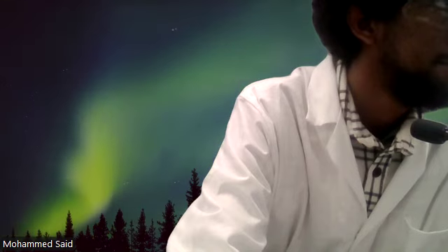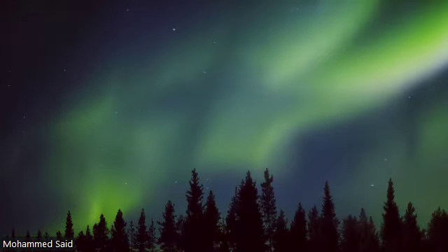If you've done, so my previous practical has done capsule staining for the unknowns as well. It's good for observations. If you've only done it for the positive, that's also okay. Let me just see the pages because I don't want you to lose marks. In the meantime, we still have time, so try to do your unknown if you can. It only takes 5 minutes, pretty much. So if you can do your unknown, that's good. It's good for your observations as well. Sorry, any other questions?